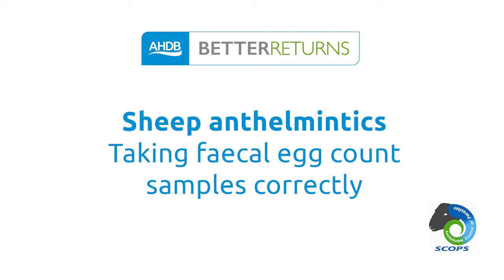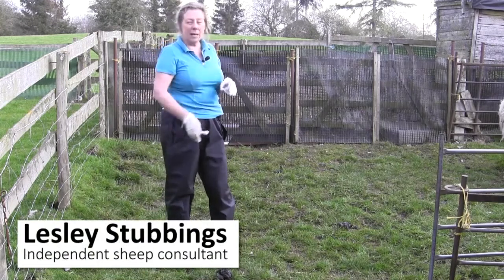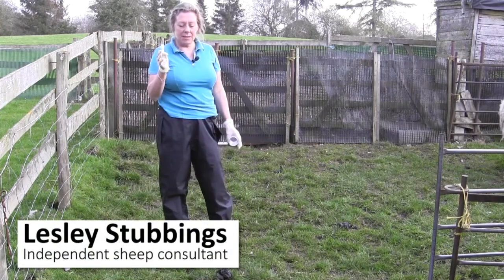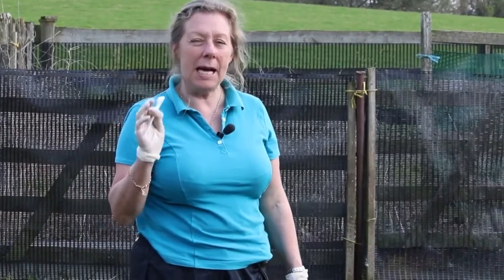We're going to take some faecal samples now to look at how many worm eggs there are coming out of our sheep. What it's going to do is give us a really good idea of how many adult worms there are inside the sheep at this point in time that are actually laying eggs.